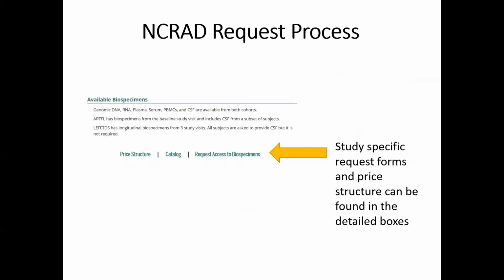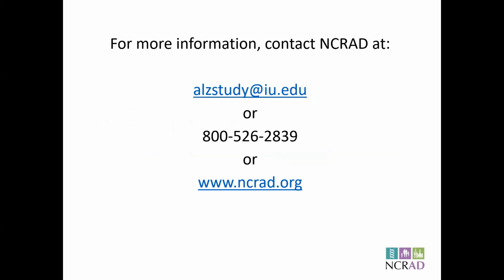As you can see, again, from our online cataloging, there's a request access to biospecimens. There are study-specific request forms as well as price structure that can be found in those detail boxes underneath each of the studies that are highlighted in the Accessing Biospecimens portion of the NCRAD website.